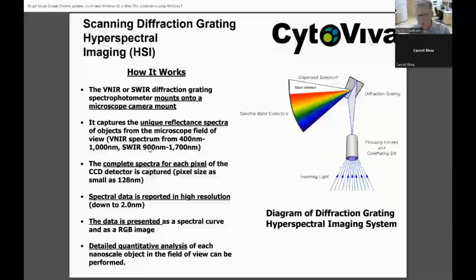Having 2 nanometers of spectral resolution would help you there. Let's say, for example, that it created absorption between 460 and 470. So with 2 nanometers of spectral resolution, that spectral change is going to be easily recorded and easy to understand that it's not an artifact. It's truly a function of, in this case, the functionalization of your nanoparticle that you're looking at.